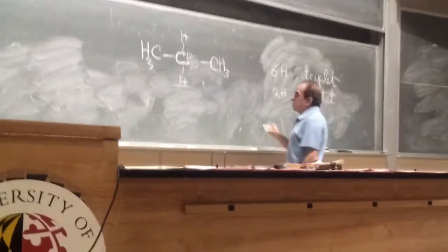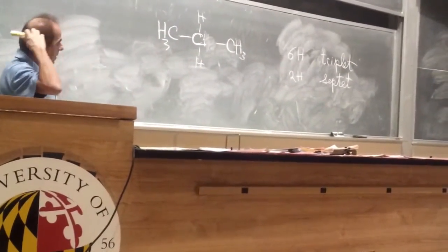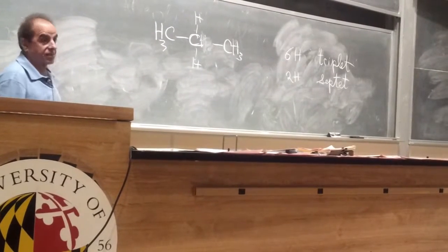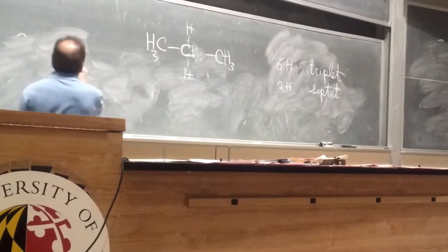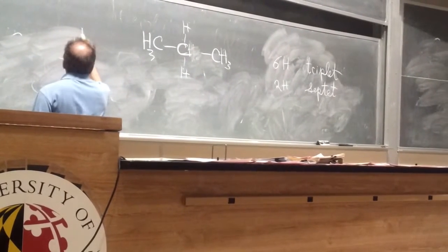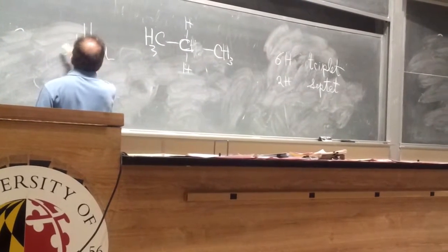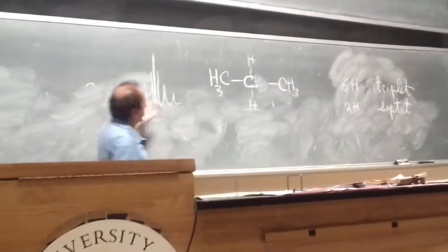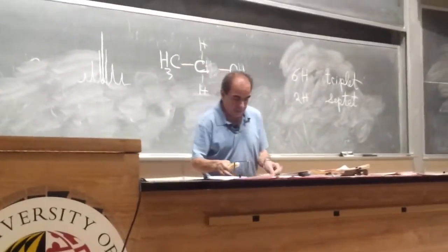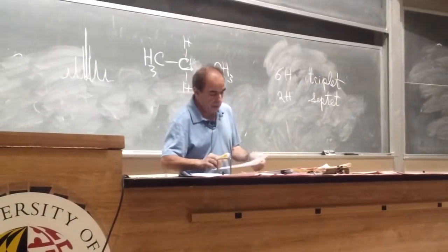Usually when we get to a septet, you can see that we actually expand those for you in the NMR spectrum. You can see the seven peaks, but the outer peaks are usually very small. So you get something like 4, 6. Actually, there is one other peak here. Something like that. So the outer peaks are even smaller. You can check some of this in your book to see what the signal looks like. Okay? Still got your bet on?